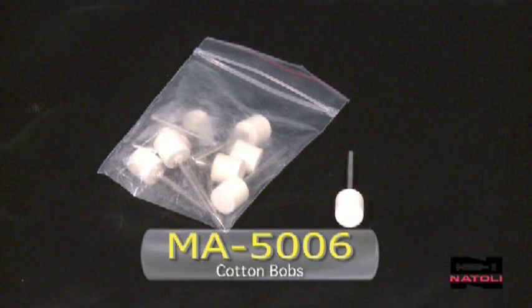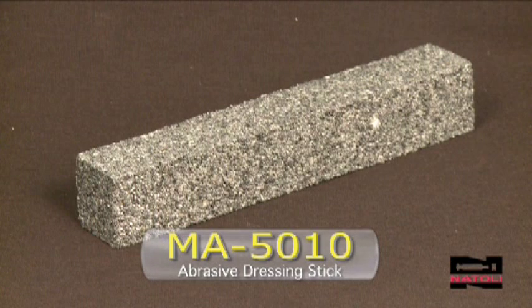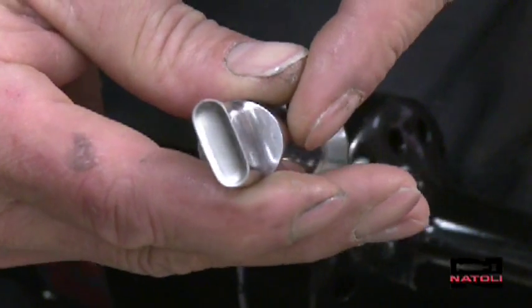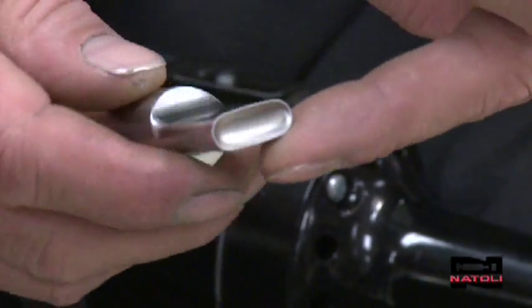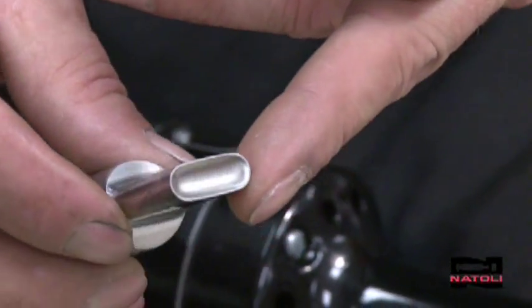First, gather the tools you will need: the Hard Cotton Bob Part MA5006, the Abrasive Dressing Stick Part Number 5010, and the Complete Hand Motor Kit Part Number MA5045 in the Natoli Catalog. What I'm going to do is take a tool that's been damaged on the inside — scratching or wear to the inside of the cup — and smooth it out to try to get that luster finish back to that tool again.